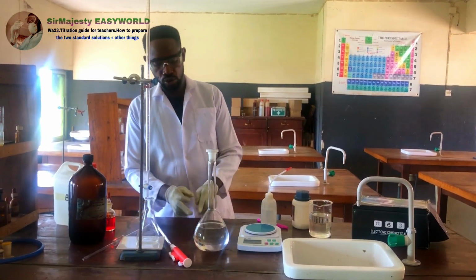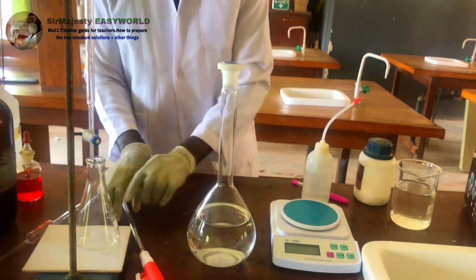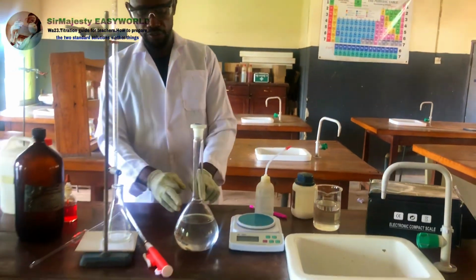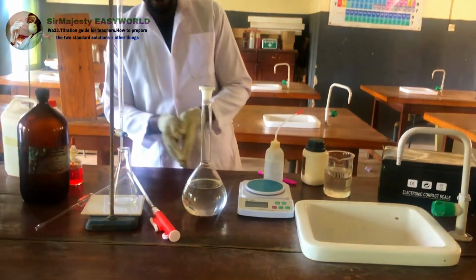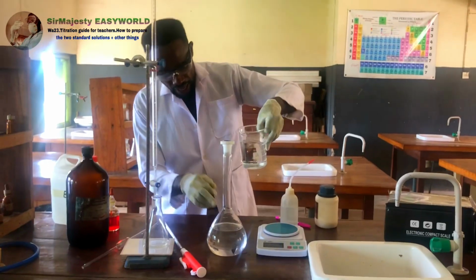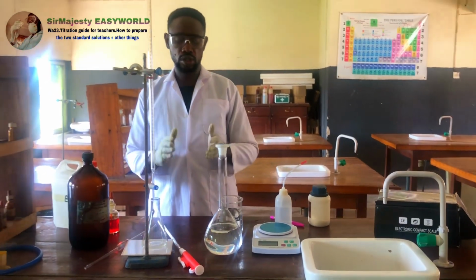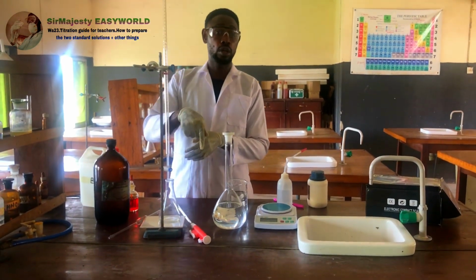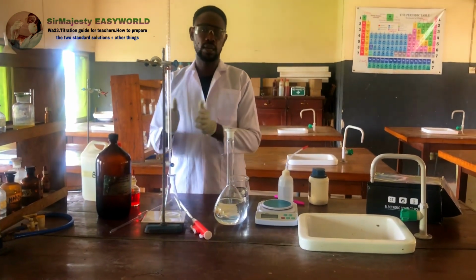See what you will not do: fill this till the rim with water, then go and measure 8.5 and dissolve. That's not the rule. What you need to do is fill to any level like now, then measure that 8.5 and add in, shake well, then use water and add up to this mark, because the instruction says 8.5 cm3 per dm cube of solution.